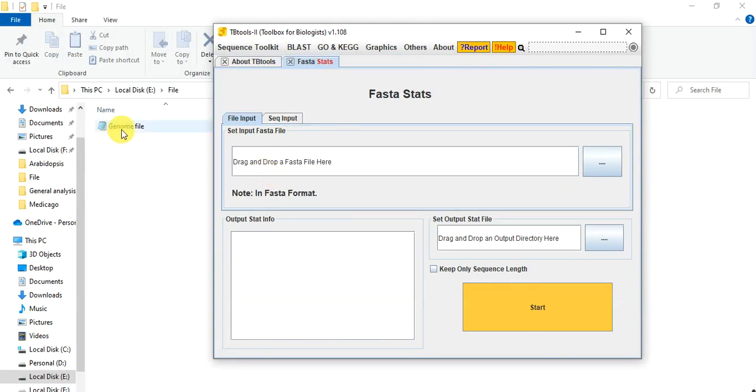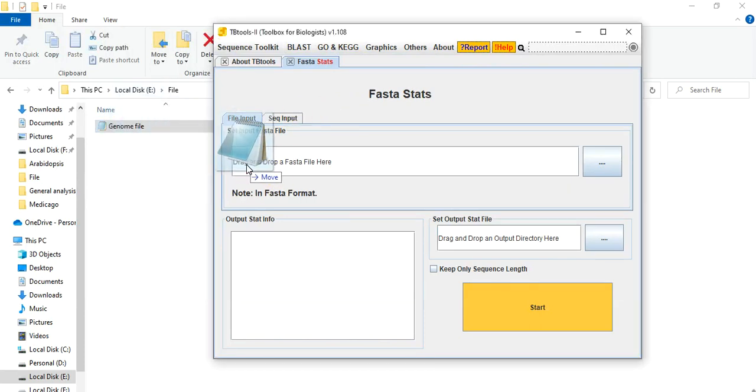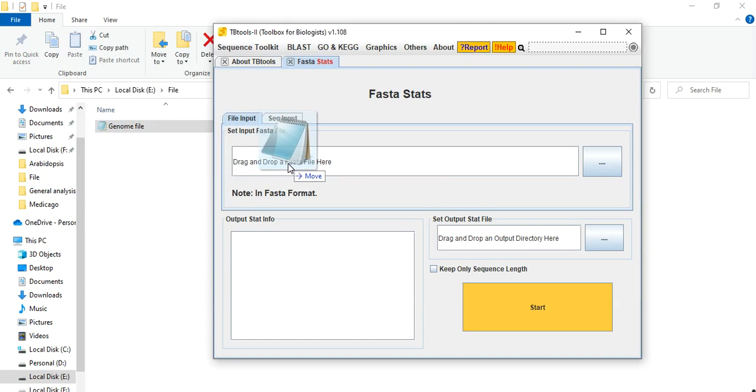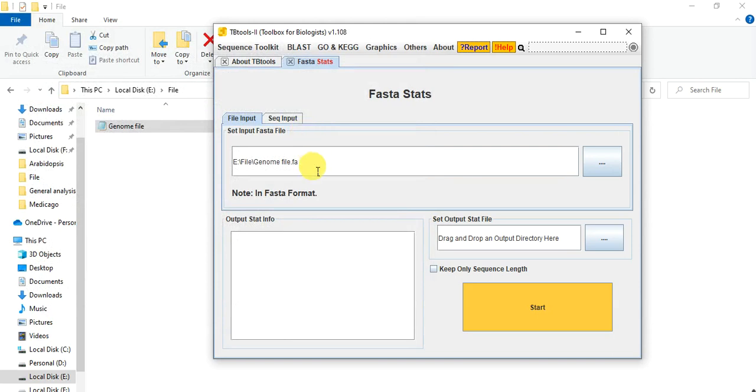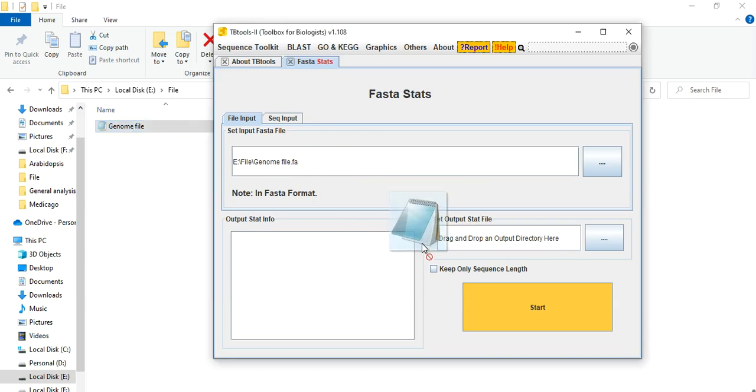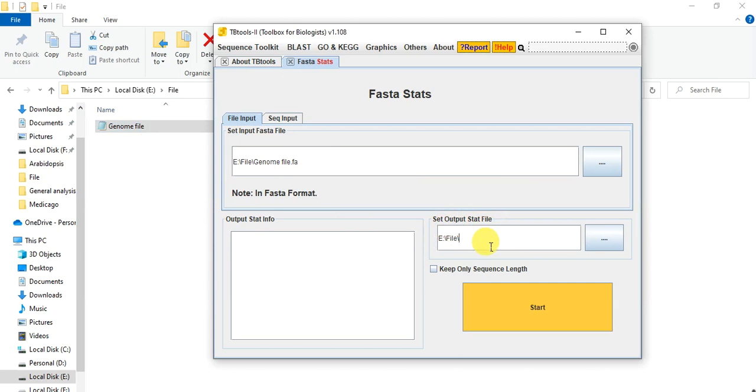Here you can drag that file and put in that input FASTA file bar. Or you can also click here and browse and then find that file and then put it here. And then here you can give the directory to output.